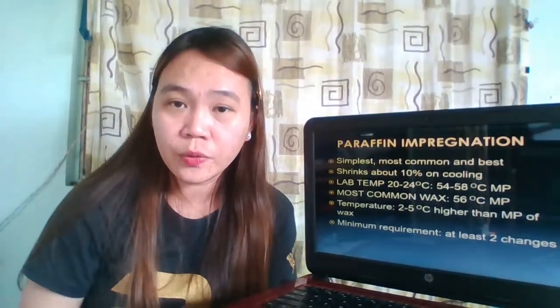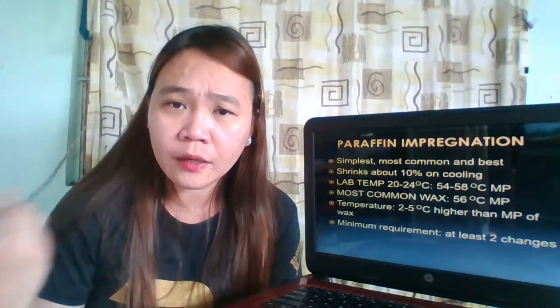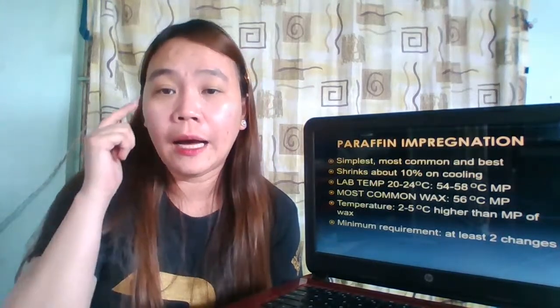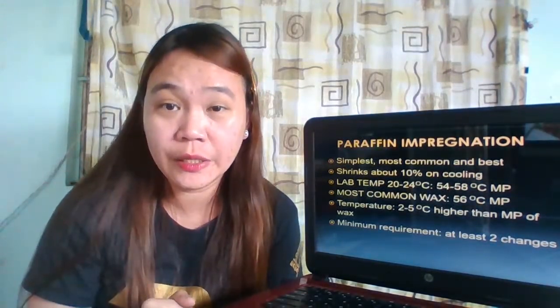And so, if hardness of tissue is one factor, what will be our general principle in this case? For hard tissues, this would require paraffin wax which will have a higher melting point.